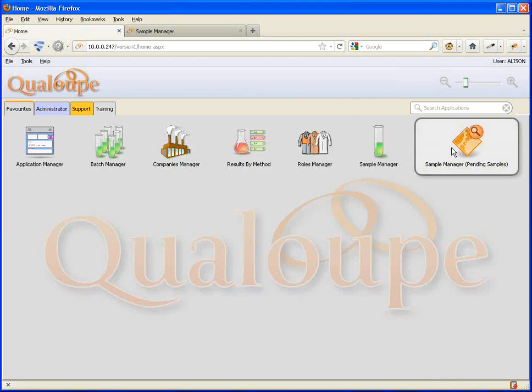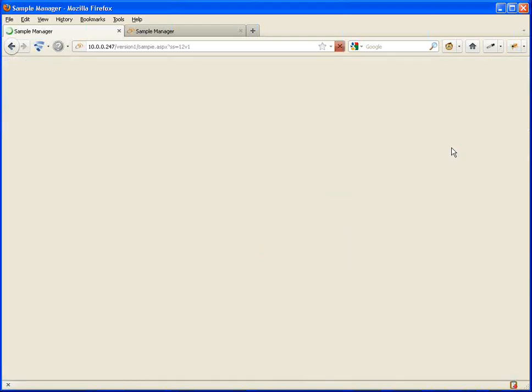So what I'll do is I'm going to launch that again. It's just going to take a little while to run, I think.